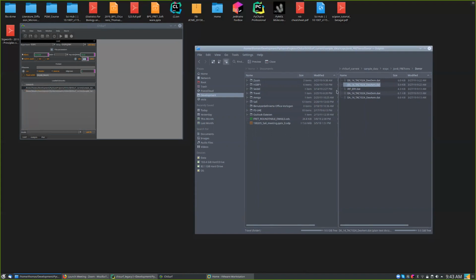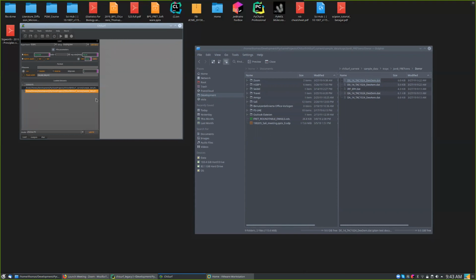So for the donor-only samples, we approximate it simply by a sum of exponentials. By clicking on these different files, it's a bit short, doesn't fit. The second one is donor-only, just remember. Once you click here for a specific file, you load it into the program, and you can select different models. There's a lifetime model, that's just the sum of exponentials, a FRET model with discrete FRET rate constants, Gaussian distributed distances for FRET, or this PDDEM, which is a model for the energy migration between a donor and acceptor and back, so for homo-FRET in principle, or here a one chain model. So for donor only, we first use the lifetime.